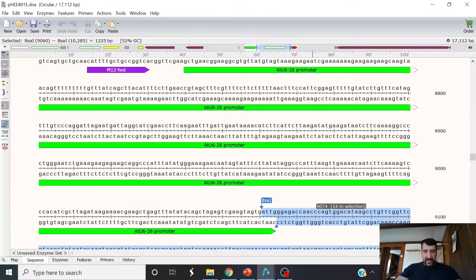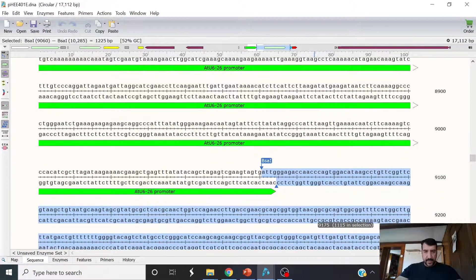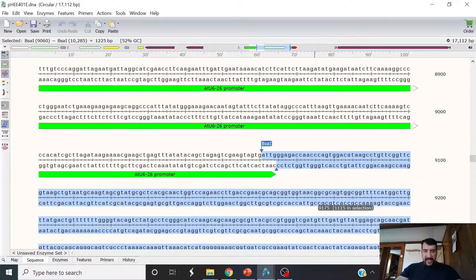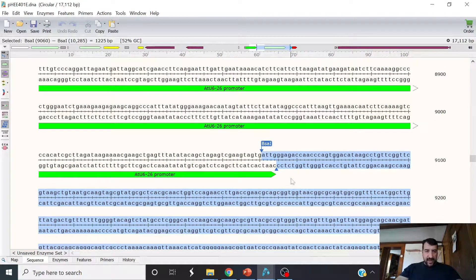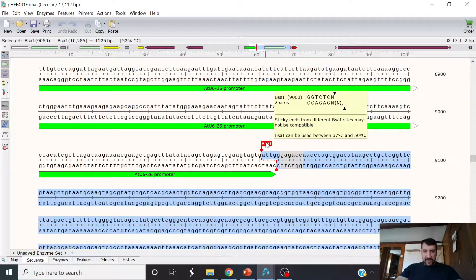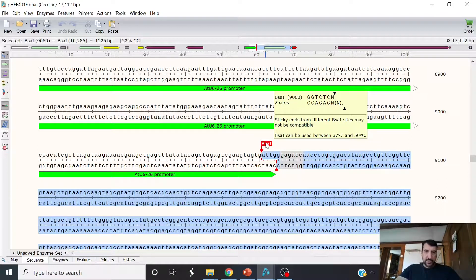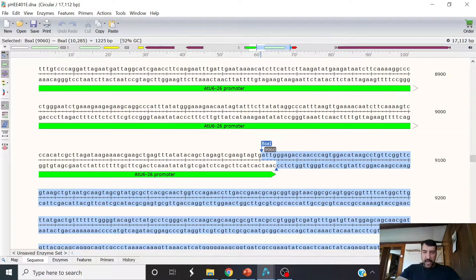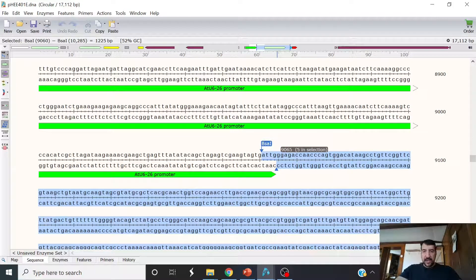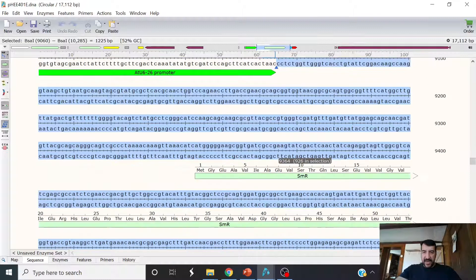Have a look at this here. So we have the ATU6-26 promoter. And you can see here's the first BSA1 site. And notice that we have exactly the same bases here. It's always going to be that with this promoter, right? So we have ATTG. That would be the adapter that is needed on one end of that.